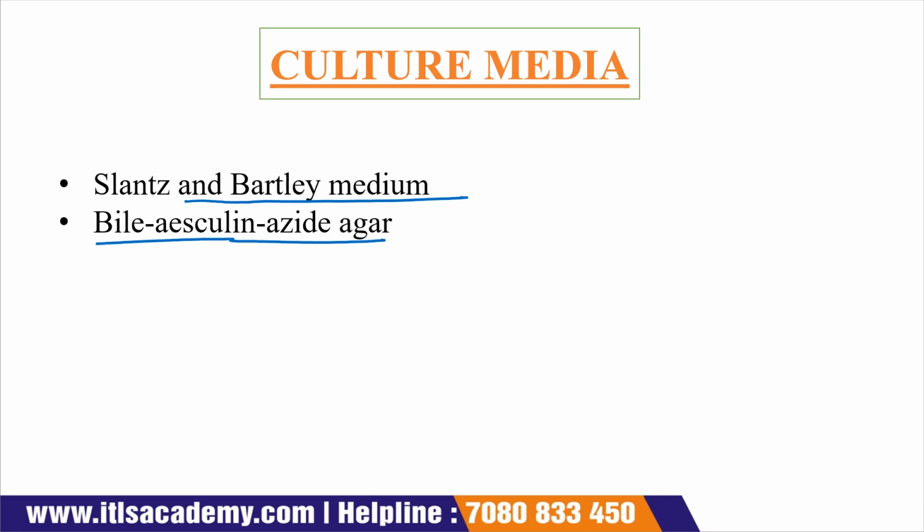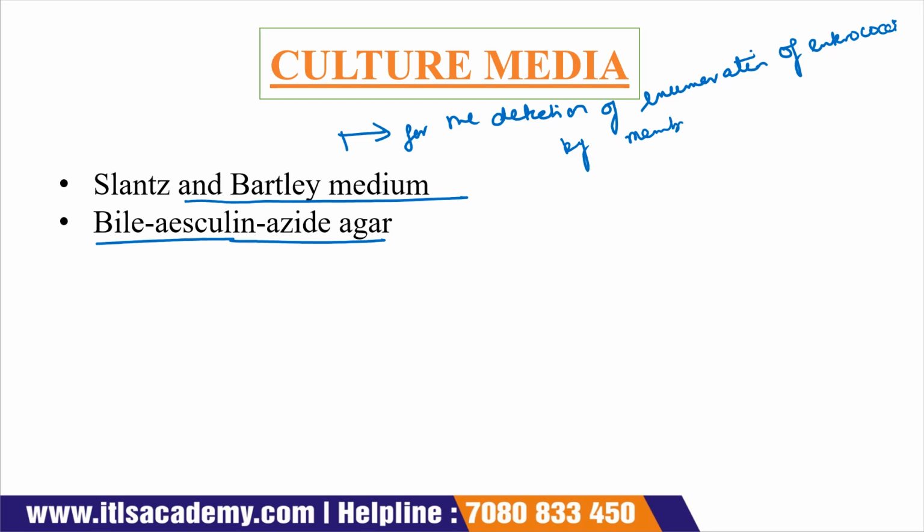The first one, Slanetz and Bartley medium, is used for the detection and enumeration of enterococci by the membrane filtration technique. And the composition of this we have already discussed.